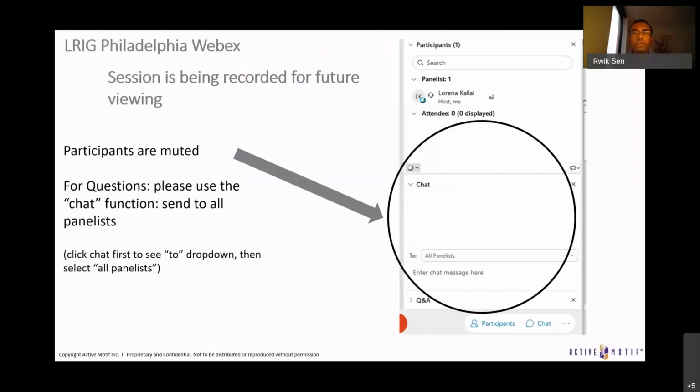There's a two-part question. One is, in the video you show the mist coming out of the wells during sonication. Why doesn't this cause cross-contamination, and how is that prevented? That's a great question. What I showed you is what you will not be able to see in the actual machine because it has the lens array on top. This is just to show how the functioning is happening, and your samples are in the microplate. The bubbles are hitting the bottom of your microplate on the outside exterior surface. They are not coming in contact with your samples in any way.